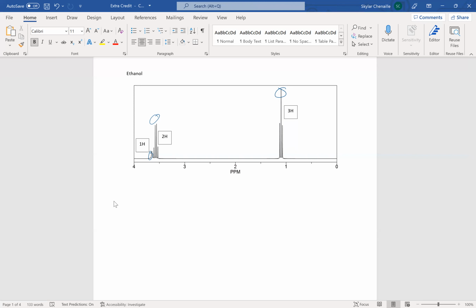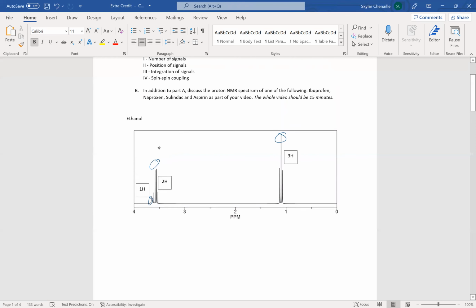The way we can separate specifically this one from the four is that it should have some sort of symmetry usually, if it is part of it. So if we look at these two readings right here, this one compared to this one, they're pretty close. Same with these two. That's coupling.